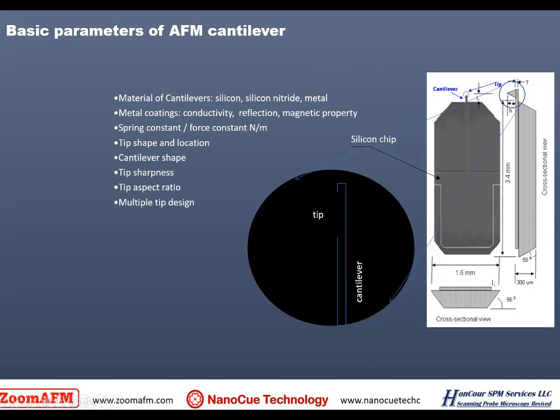This slope is so that when you put this cantilever on the surface of something, if it is right-hand side up, where the tip is protruding into the air, the tip is saved from contact, and this way you can pick up with a tweezer. However, if you flip this chip upside down, the tip actually crashes on the surface. You notice the slope is facing up. If you try to pick up with a tweezer, you cannot pick up anymore because of the slope. So that's the design of the slope, and it also allows you to identify the upper and down side of the cantilever with your naked eye. If you can see the shiny slope, you know that your cantilever chip is upside down.